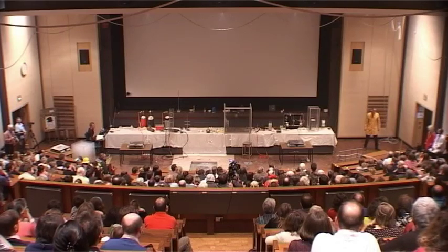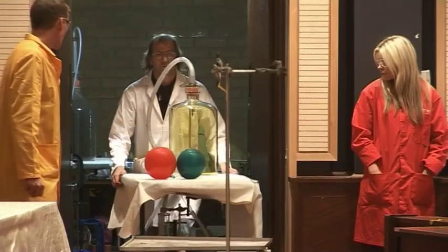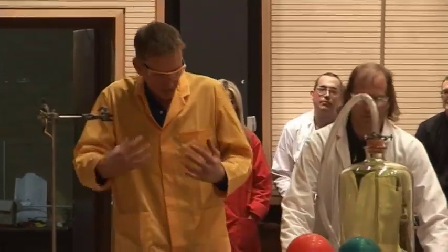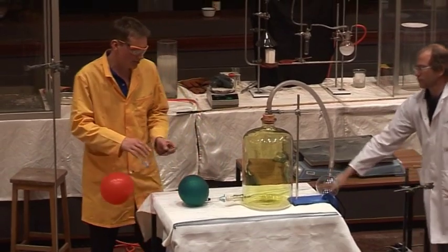We're going to see if hydrogen can burn in chlorine. The hydrogen needs — this time it doesn't burn all by itself, it needs something to start it, so we're going to use some acetylene, some of the ethyne, to start the reaction.